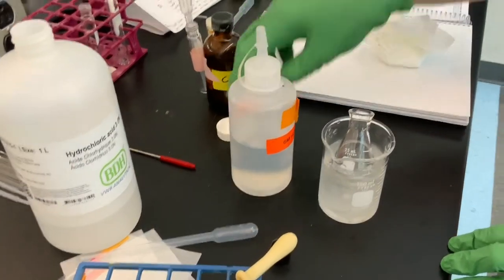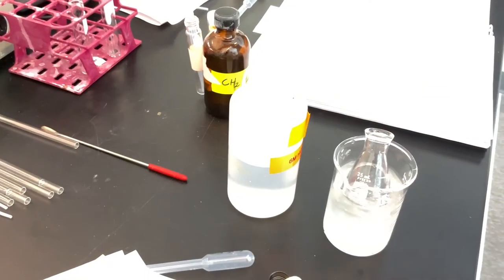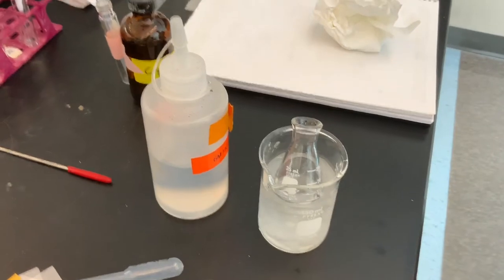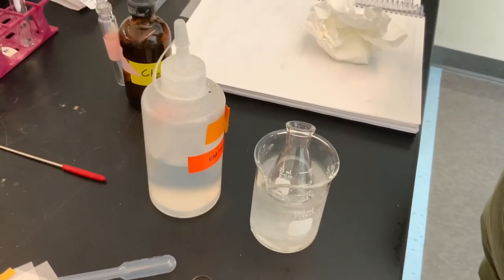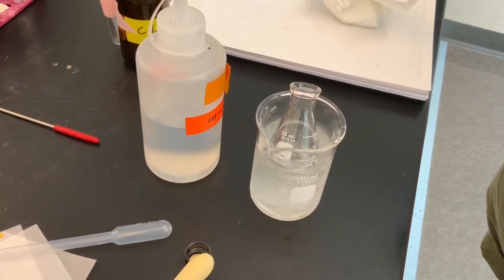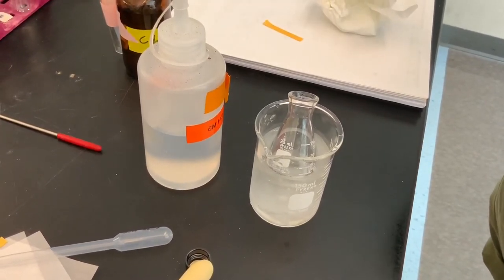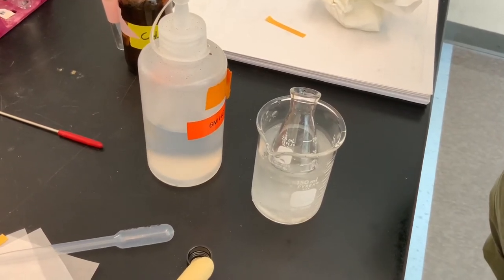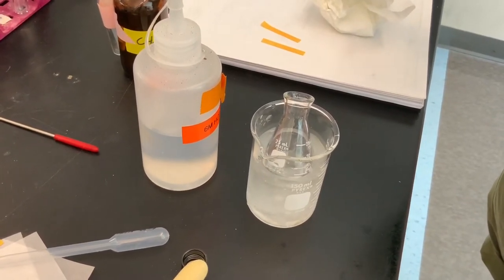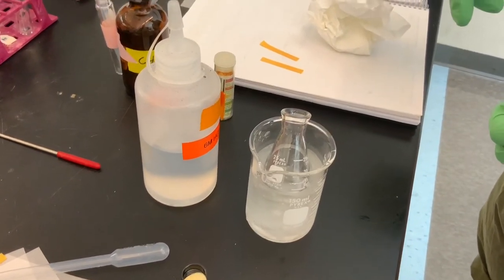And so I'm going to cap this one. Firstly, what's going to happen is we're going to neutralize the fact that this solution is exceedingly basic. As a result, we're going to protonate sodium benzoate back to benzoic acid, and we know that benzoic acid is not very water soluble. All right, and so I'm just going to get two new pieces of pH paper so that we can convince ourselves that's what we're doing. And my glass stirrer is over there. I'm using that at the moment.